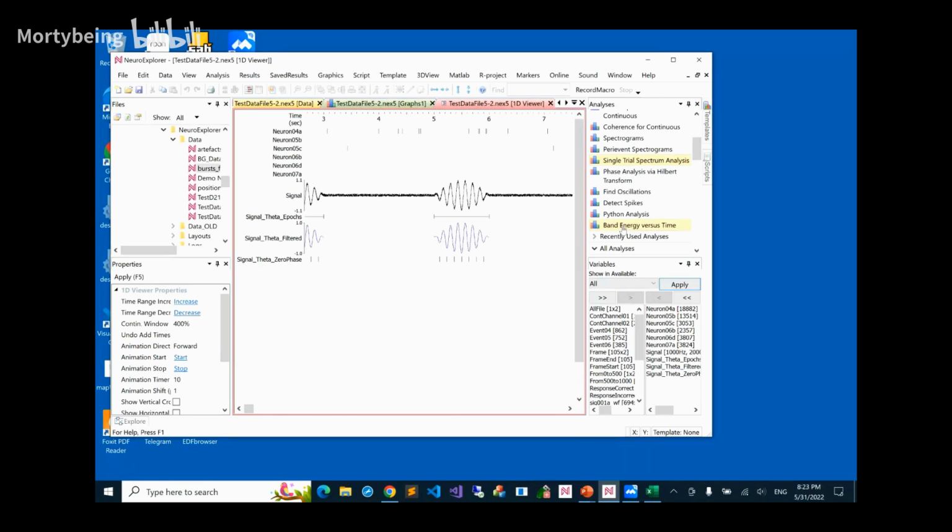They didn't care about spike sorting. They wanted basically all the spikes from the signal. So I added this detect spikes analysis to just detect spikes, just looking at the threshold crossing. That's all. Currently there is no spike sorting in NeuroExplorer. I see. So for your customers, they probably will never use it if they have your own spike detector that already supersedes this one. Got you. Thank you.